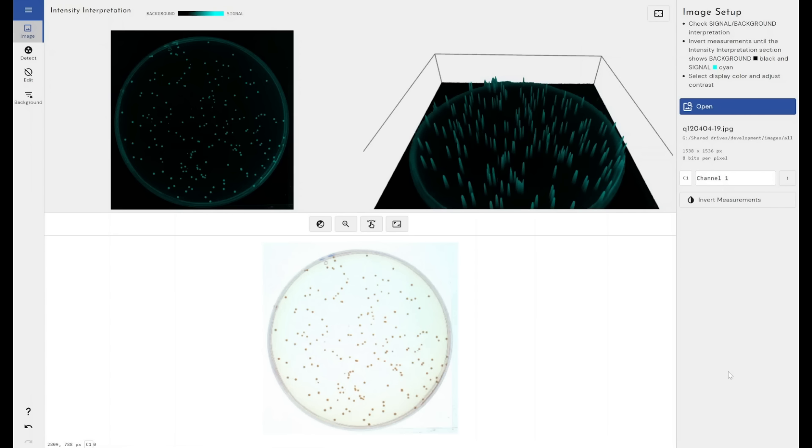Obviously automated colony counting does come with the benefit of reducing human error if you're manually going through and counting each of these colonies and not knowing if you counted a colony twice. So it does have the potential to save lab users and users in other industries a huge amount of time by automating that process and simplifying that process as much as we can.